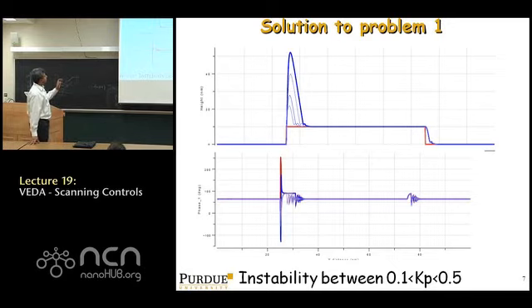So what you see, red is what you want. That's the image you want to get. Blue is the topography that you actually get in an AFM image. So you can see that the topography image you get in an AFM is not the same as the real topography of the object. Why? Because as you hit the edge, the amplitude changes, the Z controller is trying to move up and down to keep the amplitude constant.